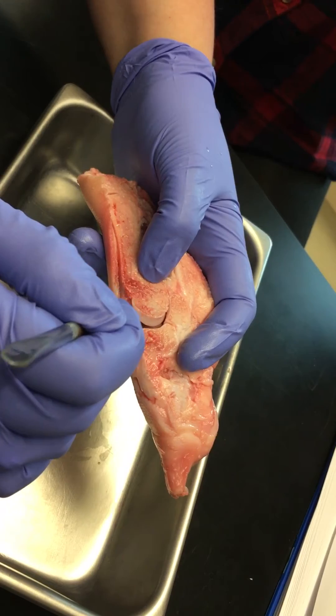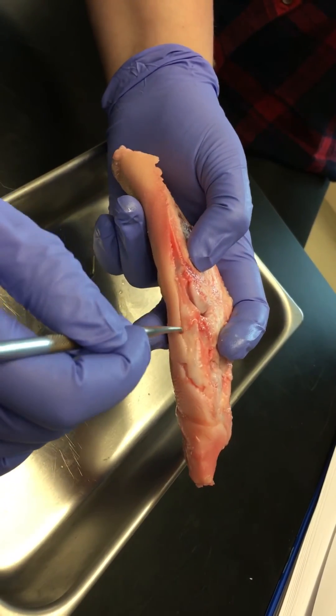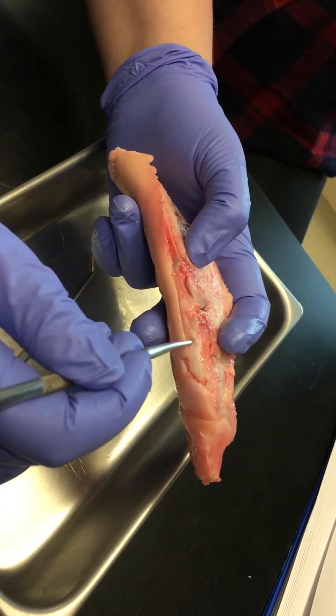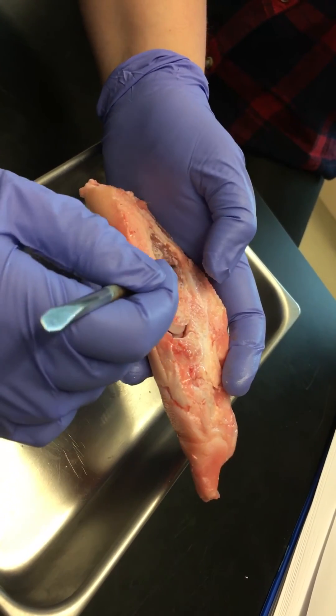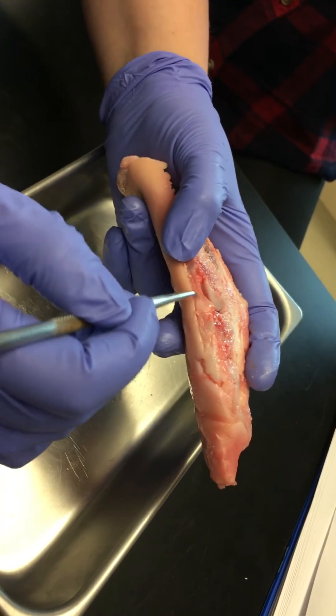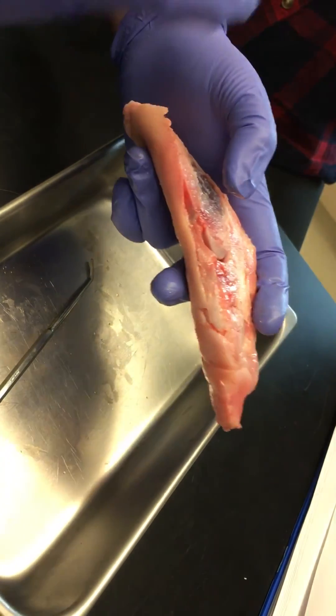The thin synovial membrane lines the inside of this cavity and produces fluid into the synovial cavity. Outside of that membrane you find this thicker stuff — this is the fibrous capsule, which surrounds this articulation for structural support. The two together, the fibrous capsule plus the synovial membrane, make up your articular capsule.